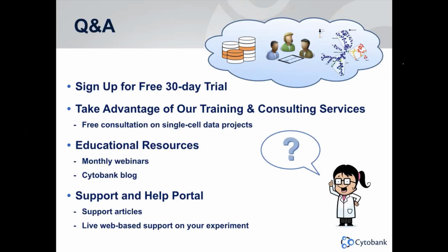Okay, actually, Anna, I'm going to ask a question on behalf of a lot of users here. I know a lot of people are interested in whether, as you have already published the paper, the data associated with the publication is available for public access, and if so, where can they access the data if they want to try out Citrus themselves?